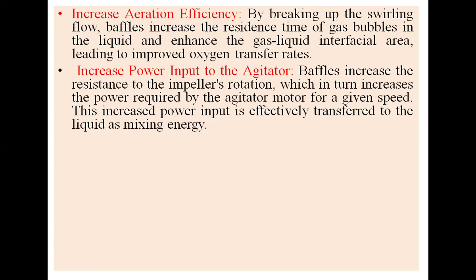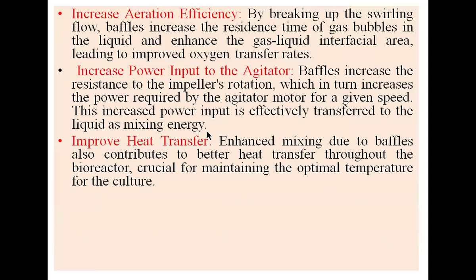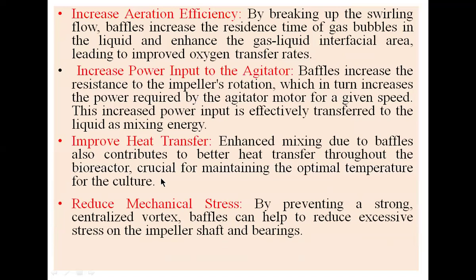The next function is to increase power input to the agitator. Baffles increase the resistance to the impeller's rotation, which in turn increases the power required by the agitator motor for a given speed. This increased power input is effectively transferred to the liquid as mixing energy. That's why mixing is very important in the liquid fermenter vessel. This also improves heat transfer: enhanced mixing due to baffles contributes to better heat transfer throughout the bioreactor, which is crucial for maintaining the optimal temperature for the culture.